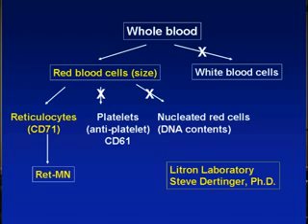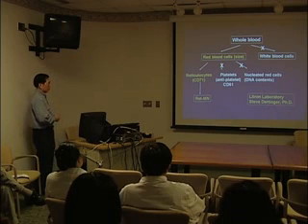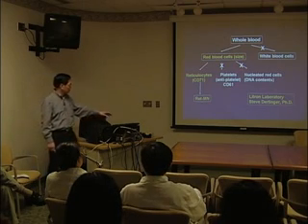So the Litron laboratory, which is actually supervised by Steve Dertinger, spent most of the time to develop this method. So what I'm going to do for the next 5 or 10 minutes is go step by step to explain how this works.